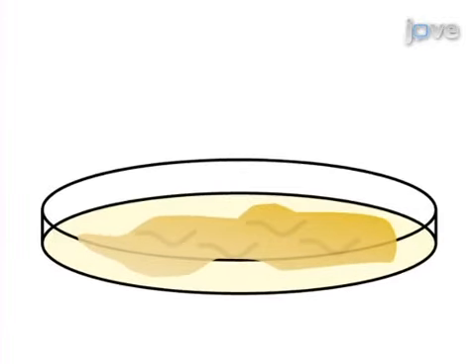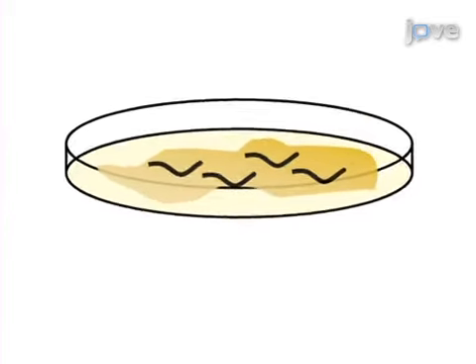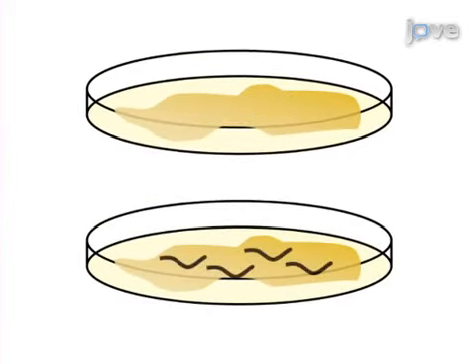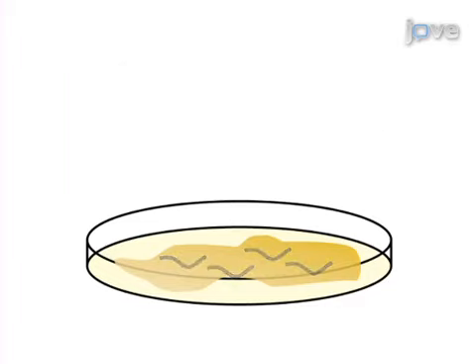Fourth larval stage hermaphrodites are transferred to the RNAi plates. Once they reach the young adult stage, they're transferred to new RNAi plates to lay eggs. After several hours, they're removed, leaving synchronized populations of embryos.